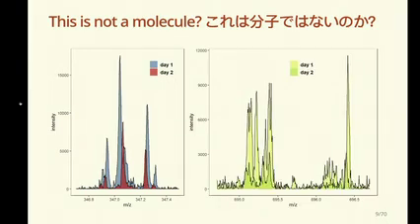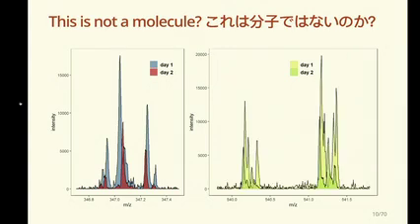But if we look at a different mass spectrum, it already starts becoming much more difficult. Where does the peak end? Where does it start? The peak shapes start becoming ill-defined, so it really becomes more difficult to see, is it a true mass peak, is it a noise feature? And as to start annotating it, it really starts to become difficult. And this is even only between two subsequent days. If you analyze over a longer period of time, it might even be more difficult. Same here as well. Peak shape is ill-defined, often for at least low-intensity peaks, but it's not because they're low-intensity peaks that they're not interesting from a chemometric perspective.